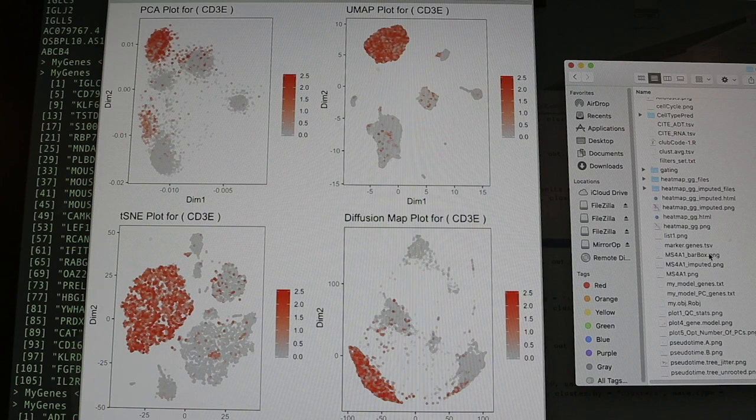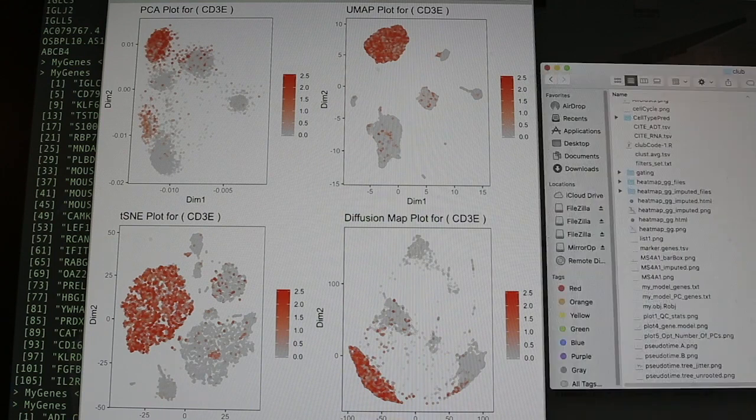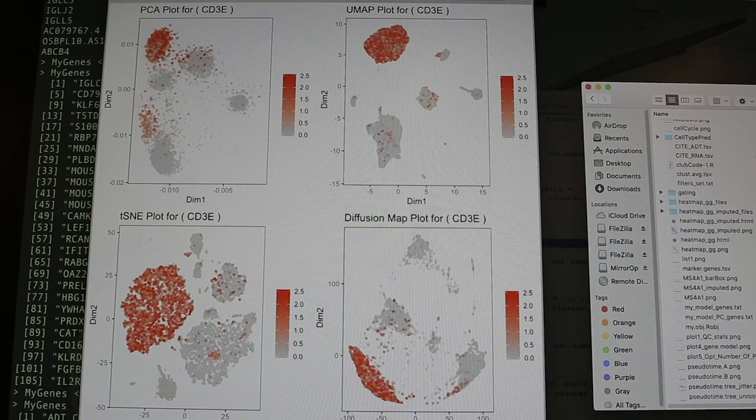Yeah, I think this is also really the main strength to me of CITE-Seq: you can go back and forth from one data set to the other, whereas in the past you'd have to do separate experiments altogether, right? Here it's all integrated together in a nice data set already. So what might have taken weeks to go from sequencing experiment to flow, back to sequencing, back to flow, is all in one package. That to me is the biggest strength.